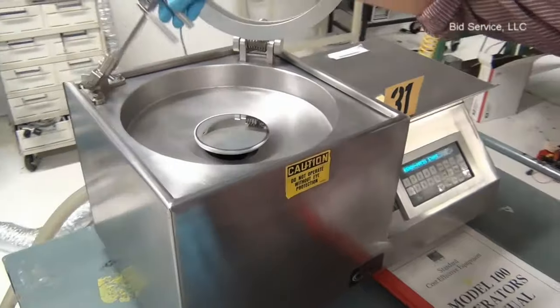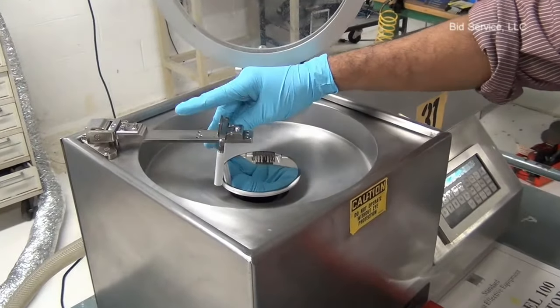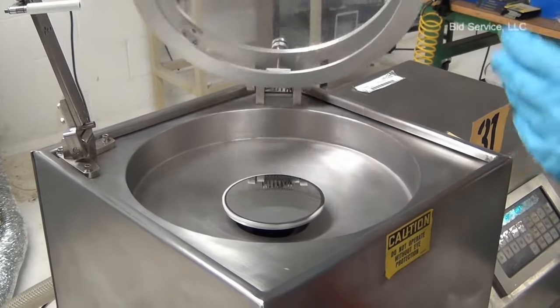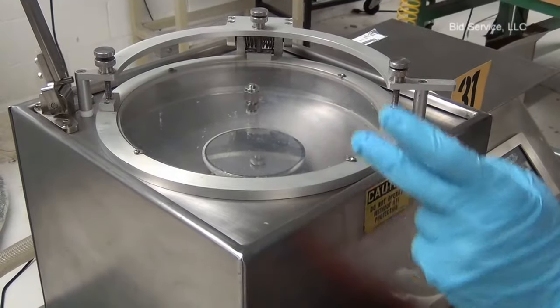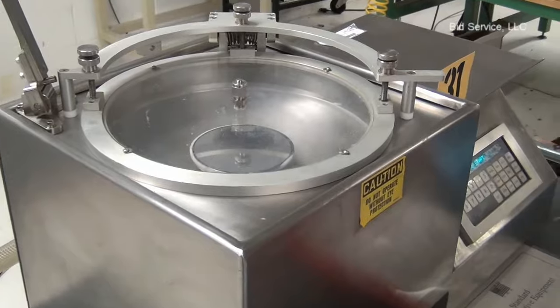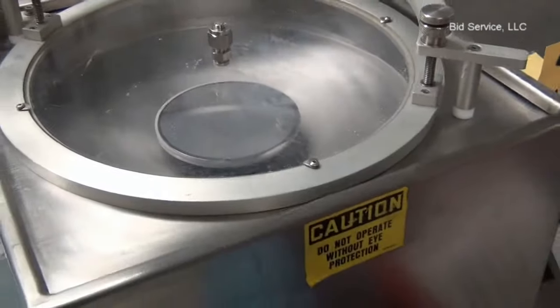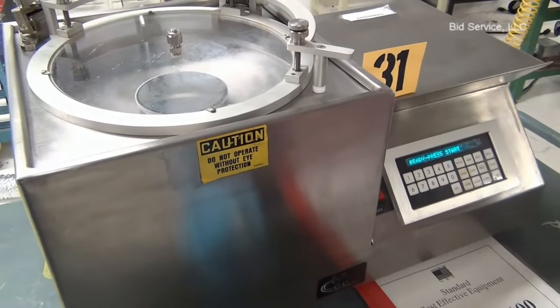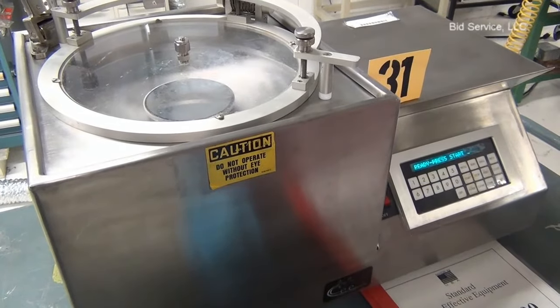The system also has a centering arrangement to center the wafer, and there is a door to seal the chamber. Precautionary measures are to be taken while operating the system. The operator should wear protective glasses.